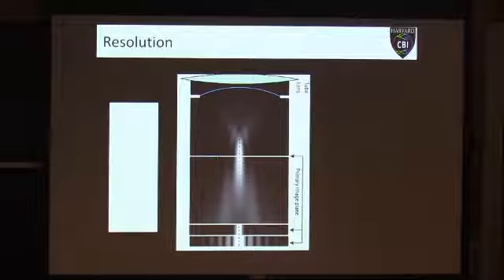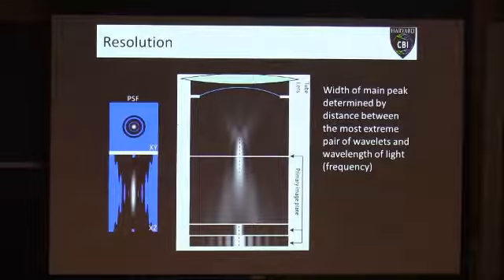So if you look at your camera chip right here, what you're seeing is this bright spot in the middle. And here we've just played with the contrast so that you can see this a little bit better. And you can see there are still some fringes along here, but they have a much lower intensity than the middle band. Any idea what this looks like? Does anyone recognize that pattern? So you probably recognize it more if I show you this one.